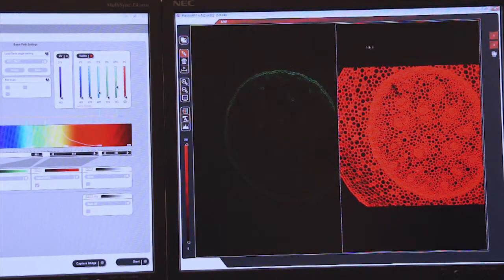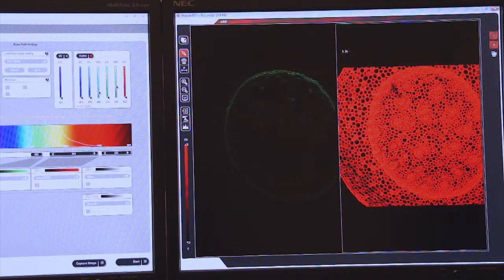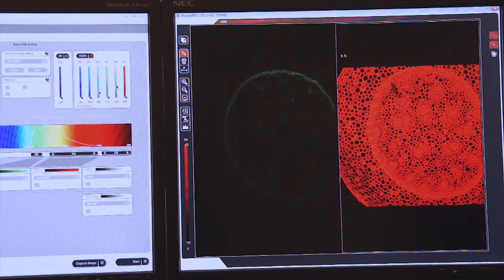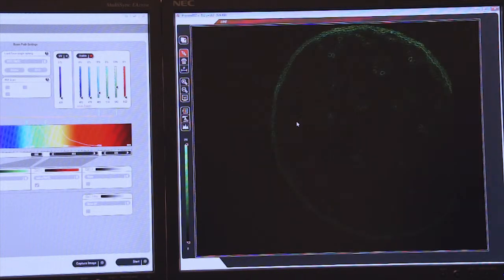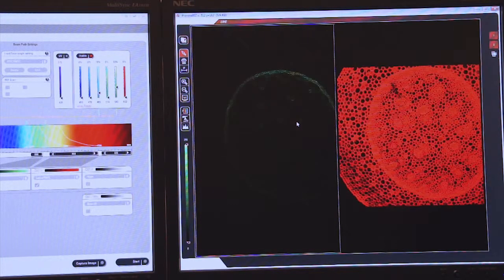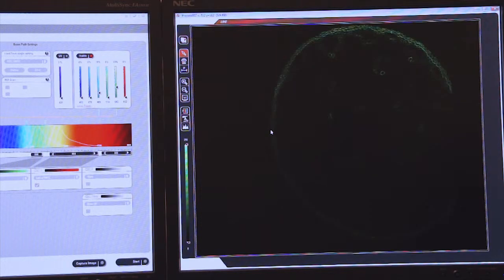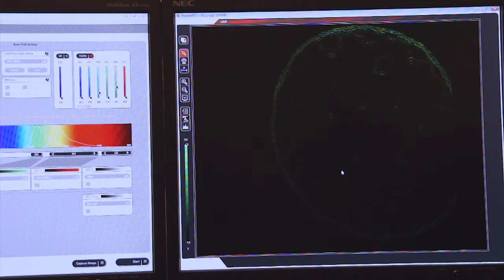Now you'll see that we have two screens divided by a square. We can click on one square or another square, and it'll allow us to work on that particular image. If we choose to work on the first image, we need to see that the light is not evenly illuminated, and it's not as bright as we would like.